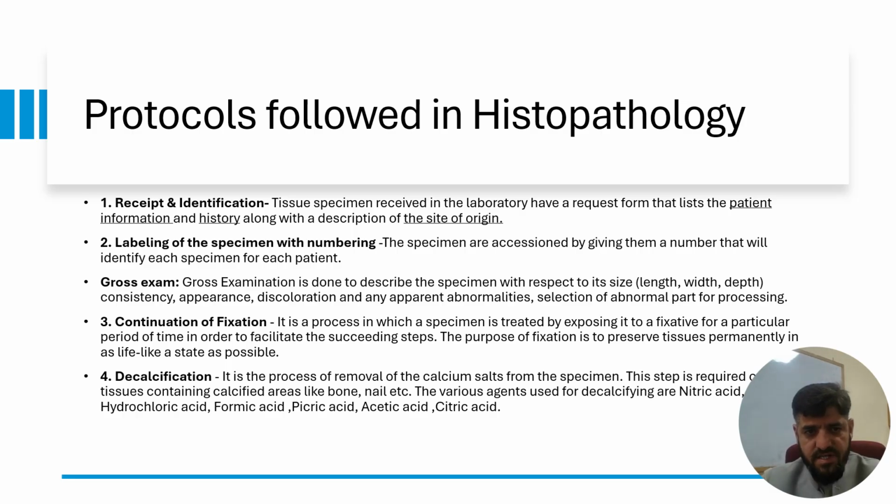Then continuation of fixation. Here the term continuation is used because a biopsy is usually fixed from the operation theater. So the fixation process must be started from the OT, or operation theater, and then we will change the fixative and provide a fixative of proper concentration. So this is known as continuation of fixation, not the start of fixation.